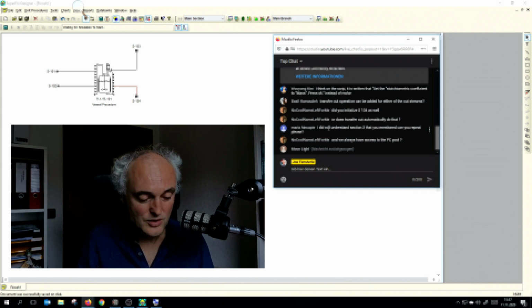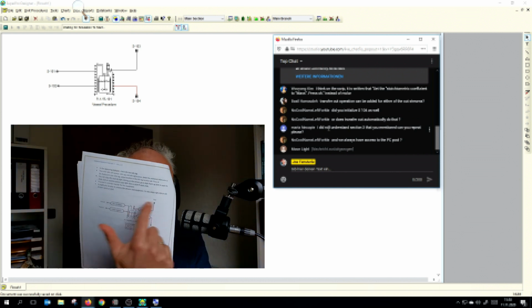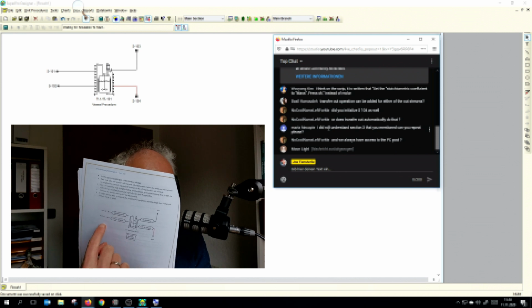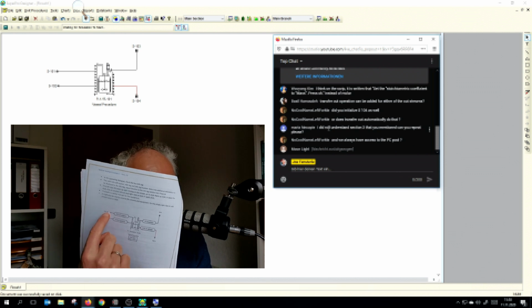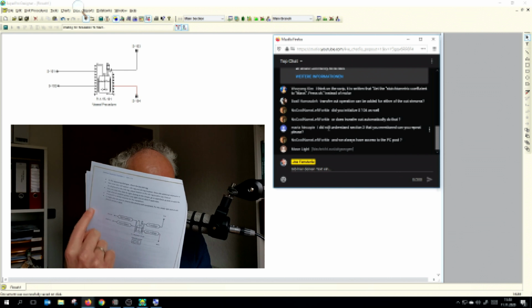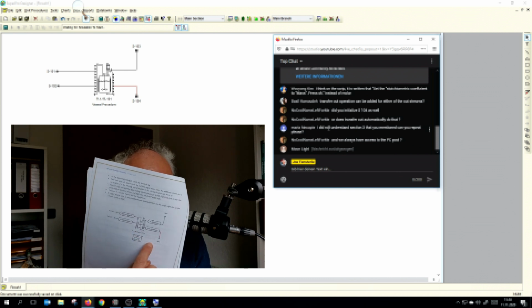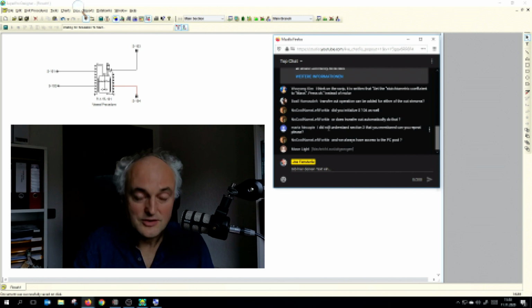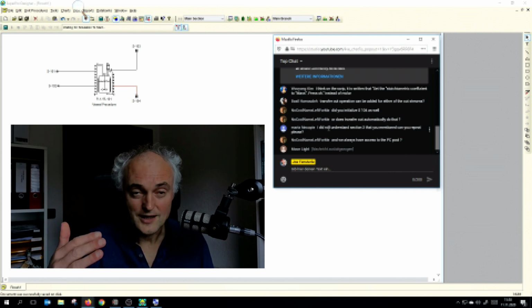So do it, and also add labels in order that it looks more beautiful, so that here acetic acid and sodium carbonate is charged and not S101, 102. And also here you see the product is coming out, and this is what you can also do to make the process clear. So this is what you should do.